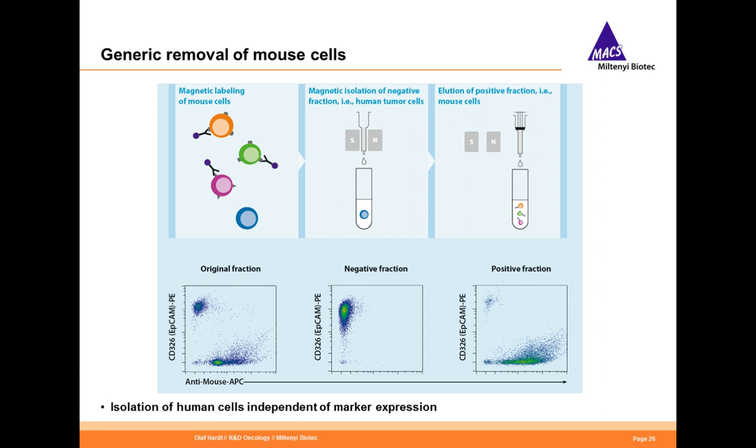And for this, we have come up with a solution some years ago by doing large cell surface marker screening. So we tested a couple of hundred antibodies on all different mouse strains, all different mouse tissues, and figured out a combination of now actually 5 antibodies that label all of the mouse cells from all the different organs, from all the different mouse strains.